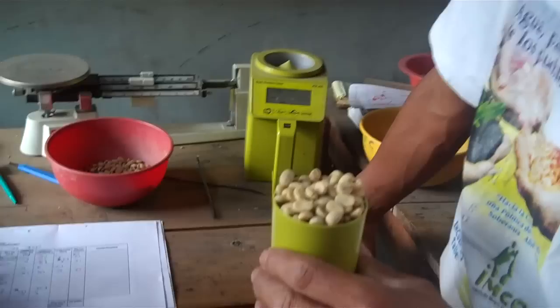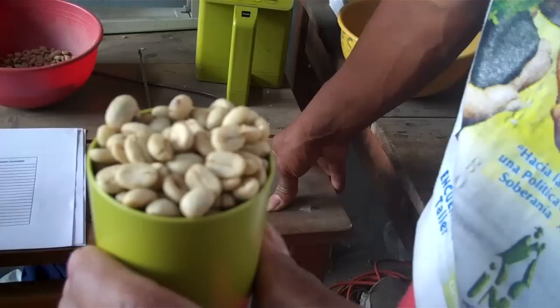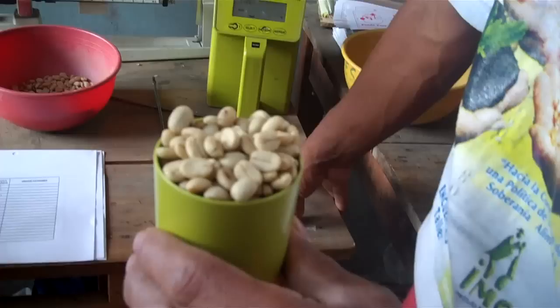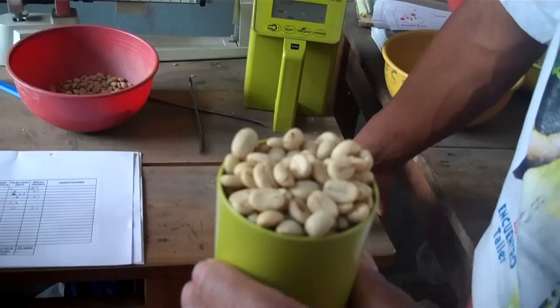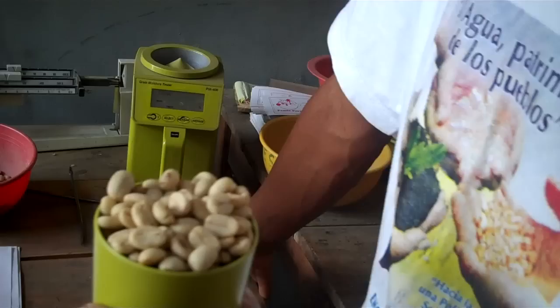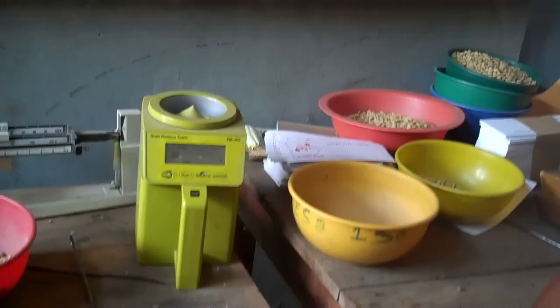Coffee comes in as pergamino — pergamino is coffee that has been dried but hasn't had the outer husk taken off. They weigh the coffee coming in from farmers and check it for a number of things to assess quality, which is great for us because we get to roast better coffee. Don Miguel has 250 grams of pergamino that he's going to put in a moisture tester. They're aiming for 12% or less.